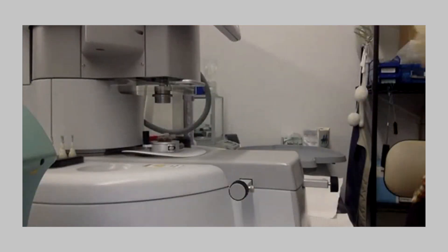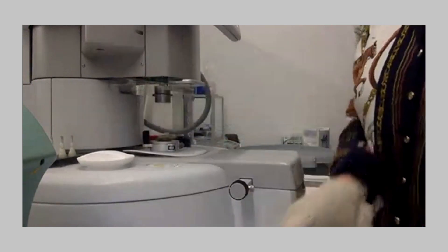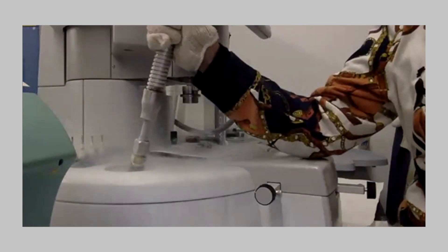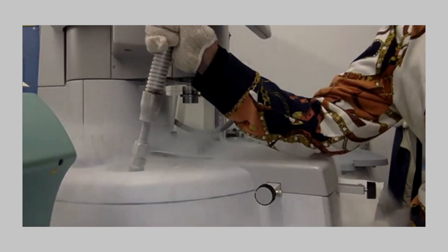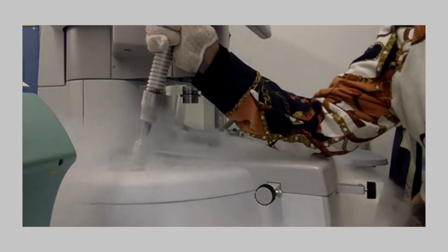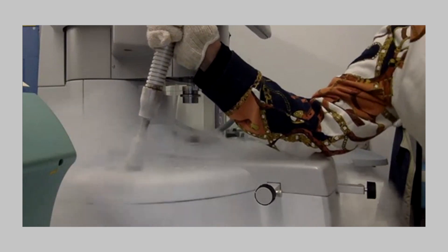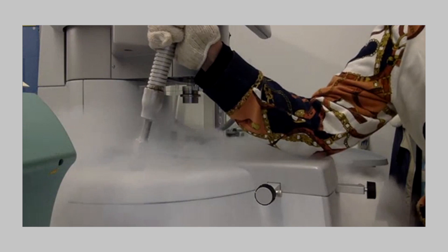I literally filled that up in three minutes. I'm going to top it off just a little bit more. It's a five-liter tank but you fill it up to four liters. You can also fill up the instrument using a dewar — not necessarily a hose — you can pour it in and fill it that way.